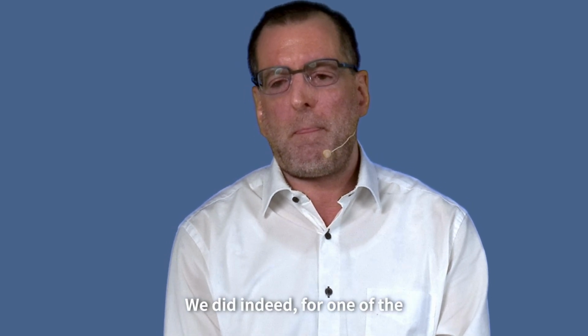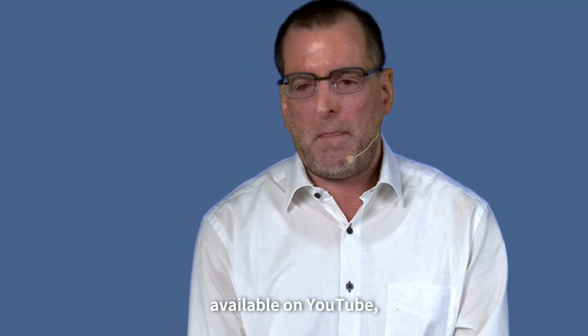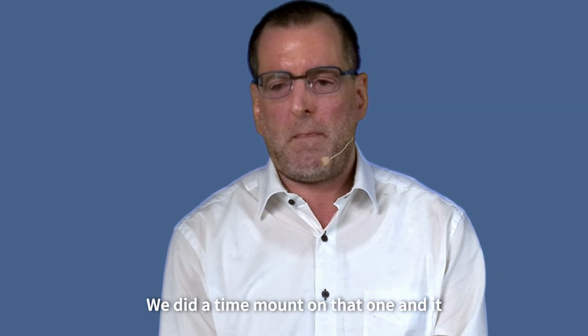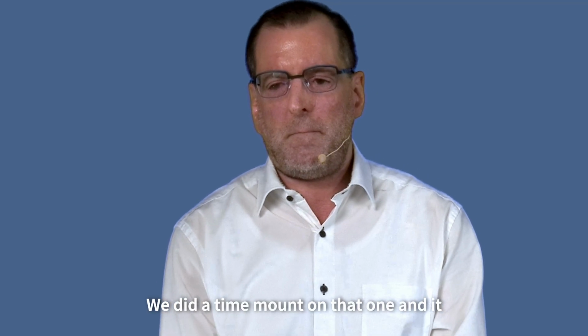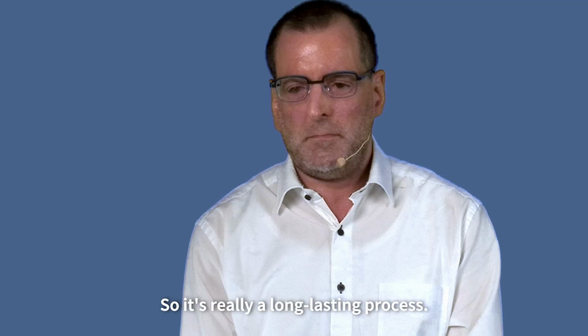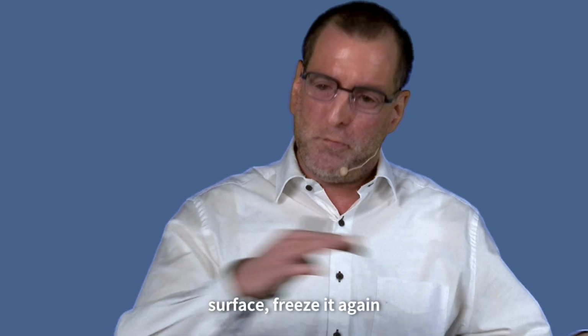We did indeed, for one of the experiments, I think it might be available on YouTube, melt an ice cube, or not melt, but sublimate an ice cube. And we did it time bound on that one. And it took us the whole day to record it. So it's really a long-lasting process. Next time, melt it, spread out the surface, freeze it again, and it will be much faster.